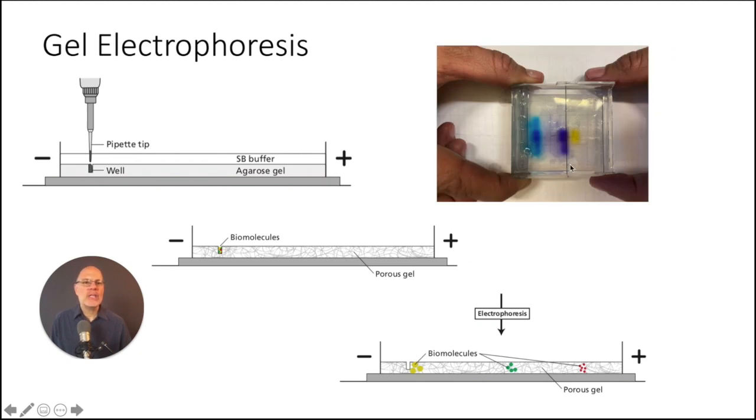So now you can see that these three inks, here was the well over here. You can see that one had these two component colors. This one had three component colors. Looks like this one only had one over here.